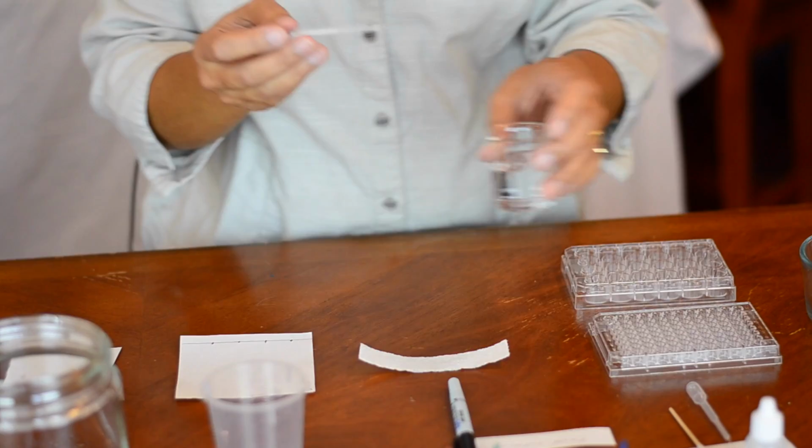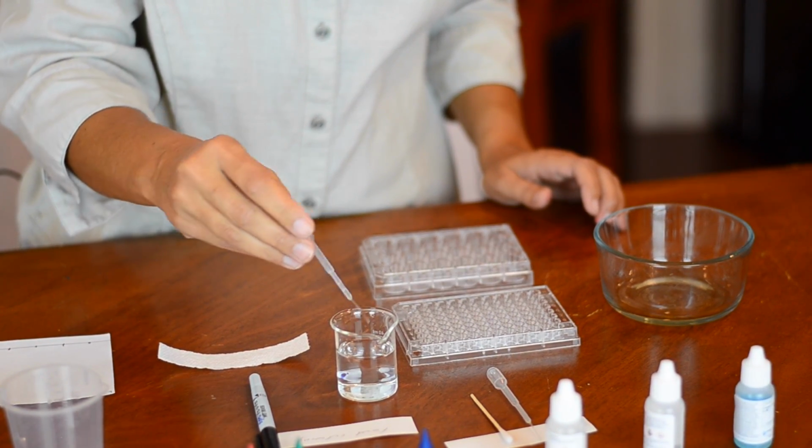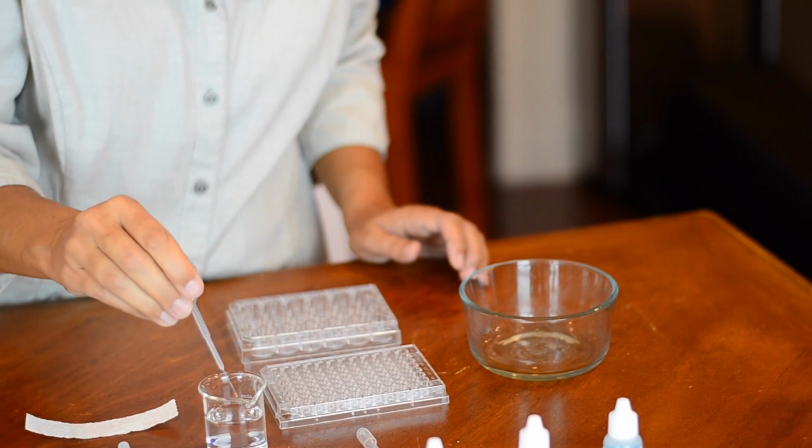And I've got a little bit of distilled water sitting in a beaker over here, which I'm going to use to rinse my mini pipette. I'm going to drop a little bit of distilled water and discard it over here. That's just so that I can use that mini pipette again another time and not worry about contaminating my next experiment. I've discarded the distilled water that I used to clean my mini pipette in a completely separate container that I have no plan to draw any water out of, so I don't get contamination that way.